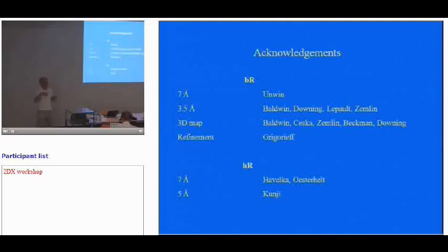So Nigel Unwin is the only one I know who's very careful about this, and he measures the conductivity. And if it's not, is it 10 to the minus 6 is graphene, and 10 to the minus 3 is, anyway, he throws them away. And we measured our films, and Nigel's are all 10 times higher conductivity than ours. And then the other thing you can do, you can irradiate them in the microscope before you put the specimen on, and that increases it by another factor of 4. So you're increasing the conductivity and the strength.